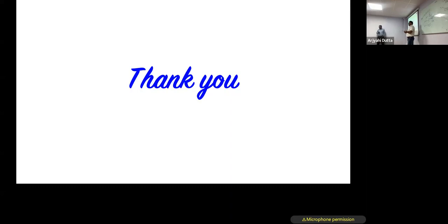So you have the electron emitter. Generally we are using a tungsten filament. Tungsten filament works by thermionic emission. Then a tungsten filament, when you coat it with zirconium oxide, is called the Schottky emitter. And I told you about some purple crystal, right? That is the LaB6 filament. LaB6 is lanthanum hexaboride or cerium hexaboride. That crystal we can use.